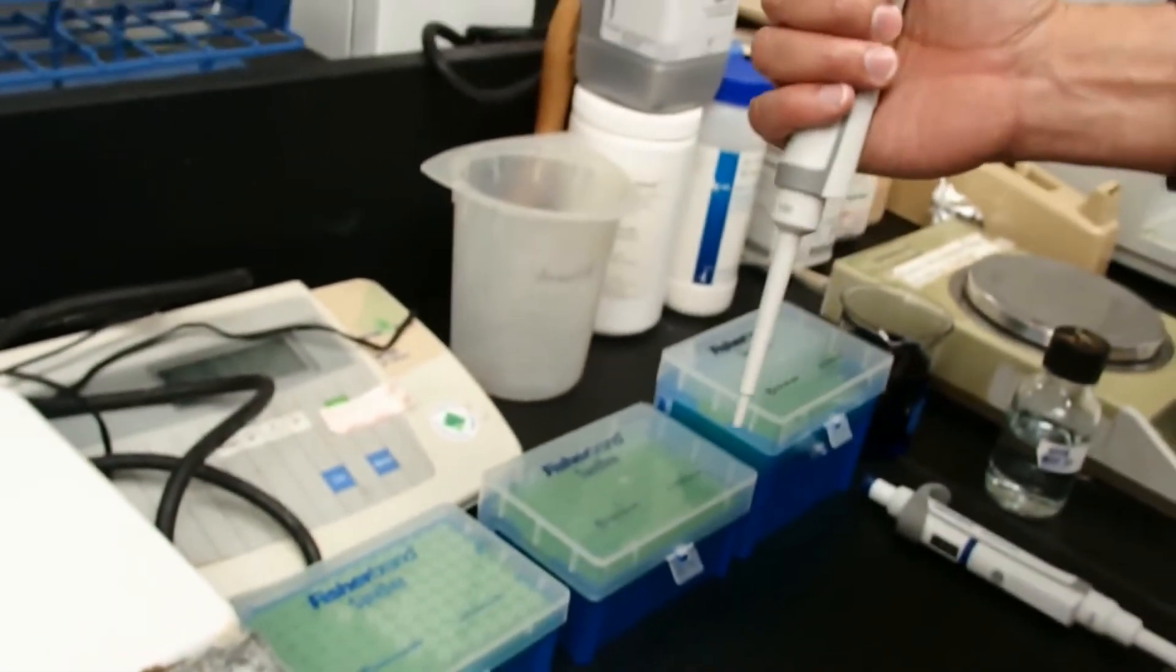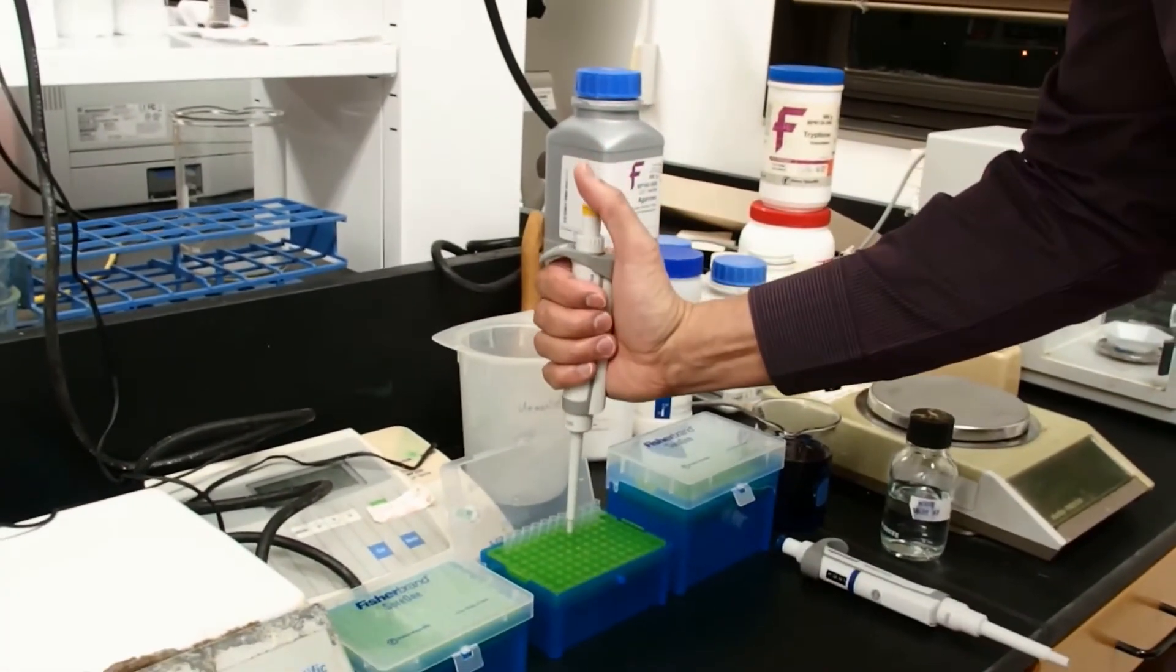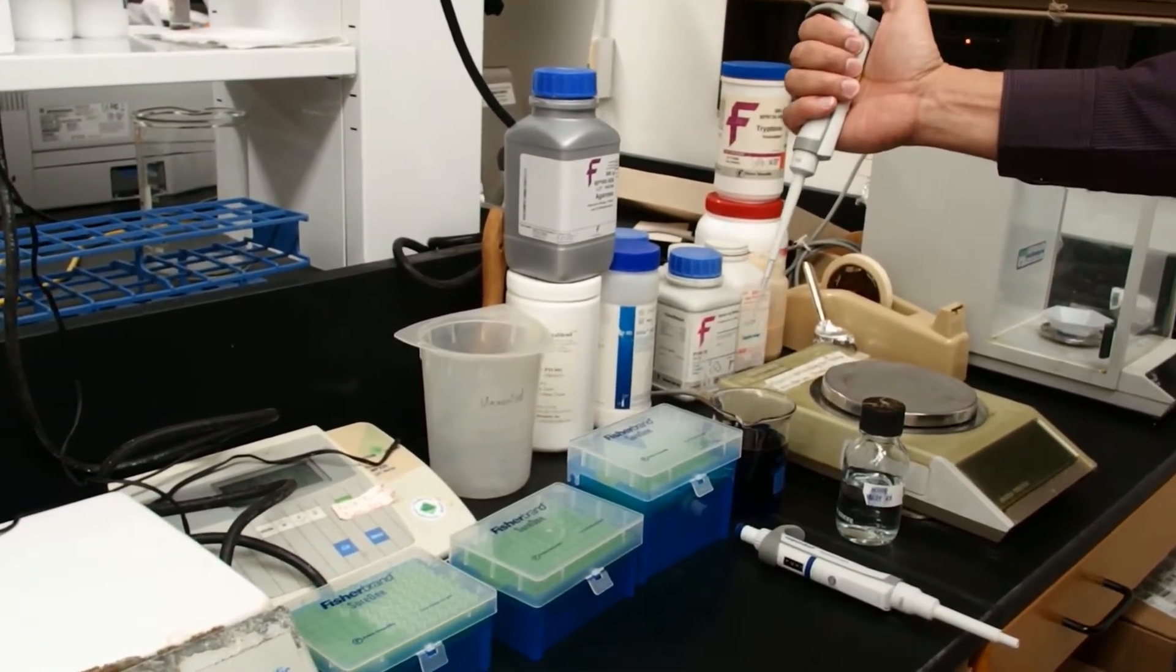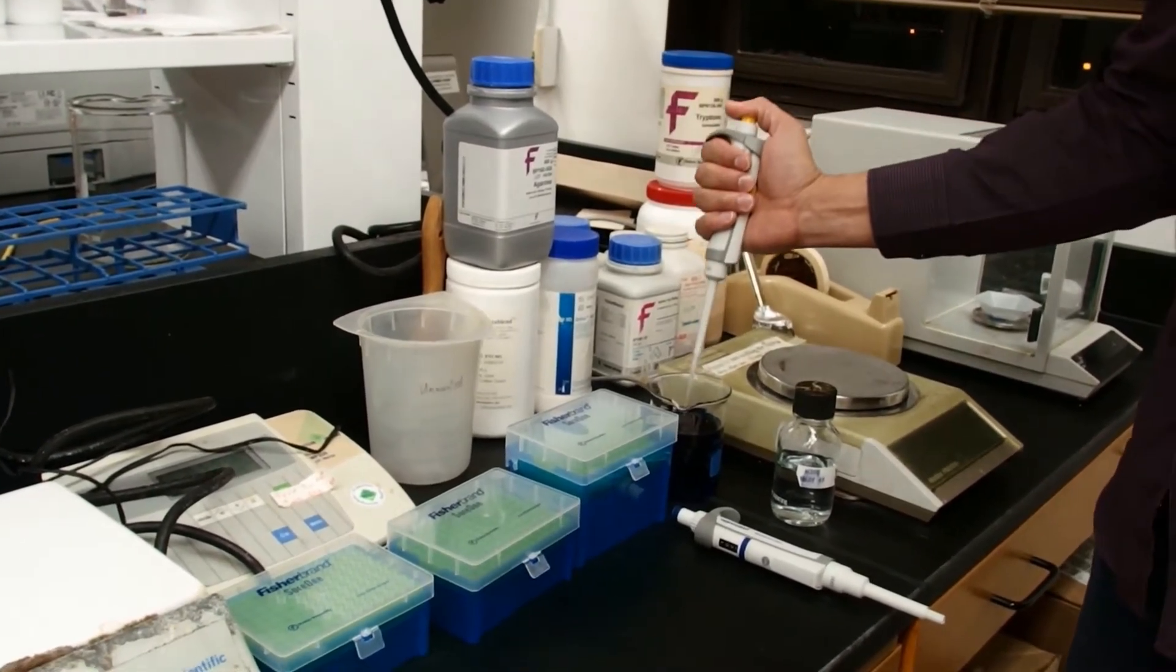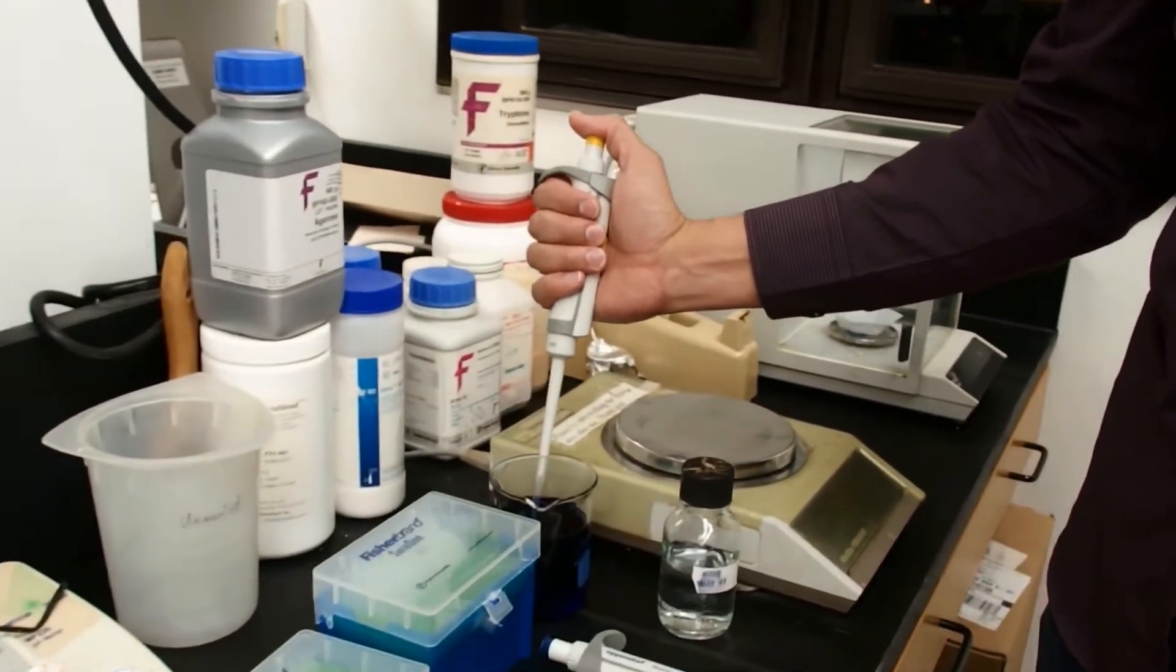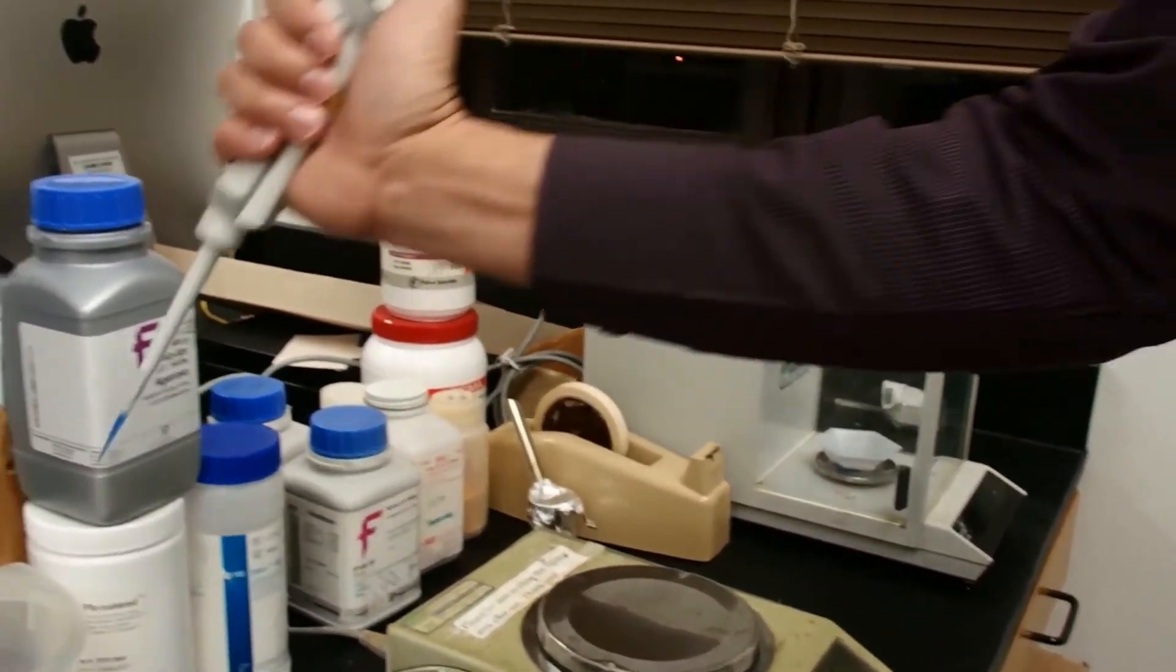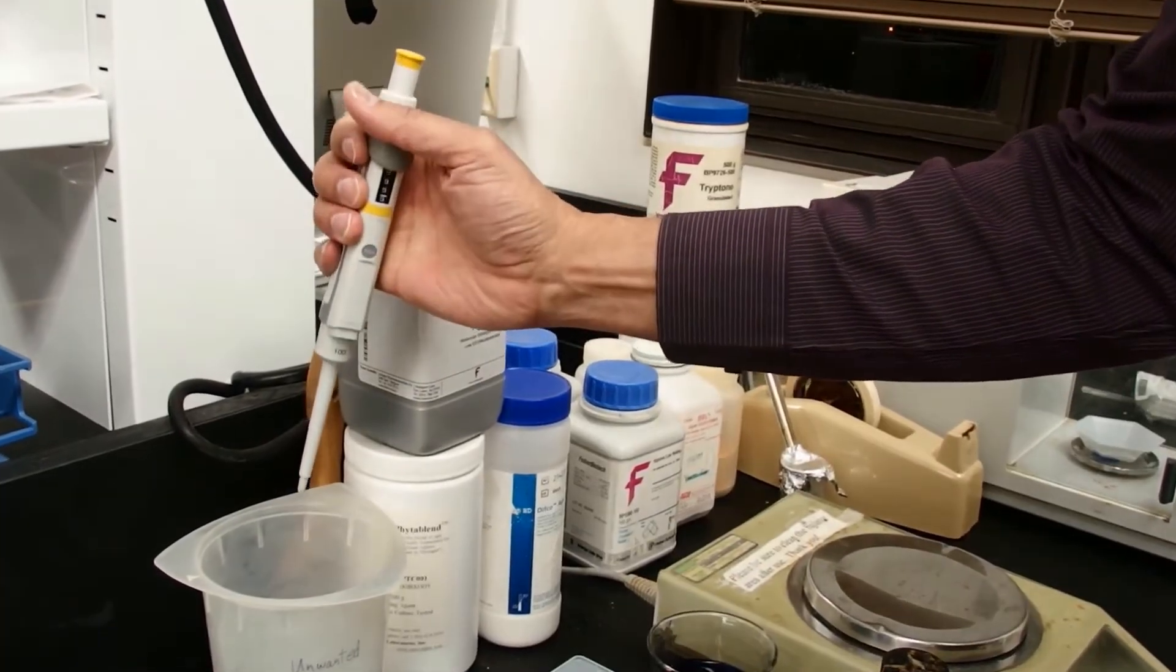Again, we'll hold our thumb in this area. It uses a different tip. We press the plunger to the first stop in the air, submerge it in the liquid 2 or 3 millimeters, and slowly pipette it up. Here we got our water. I'm just going to pipette this into the waste and eject this tip.